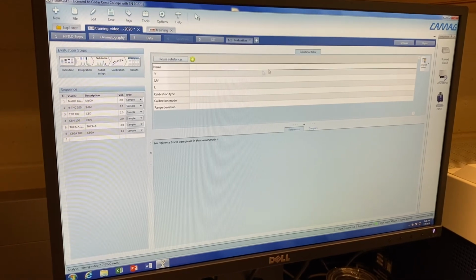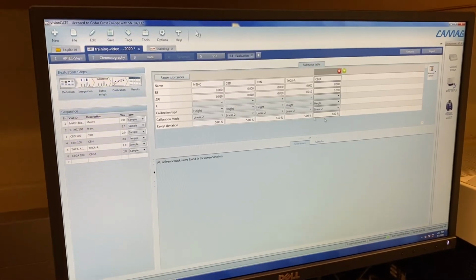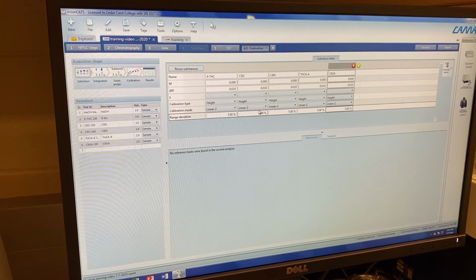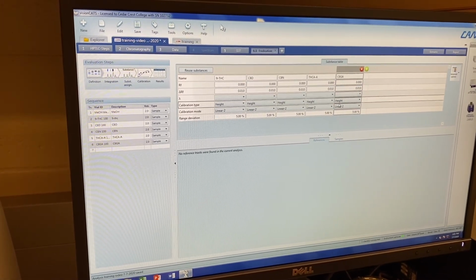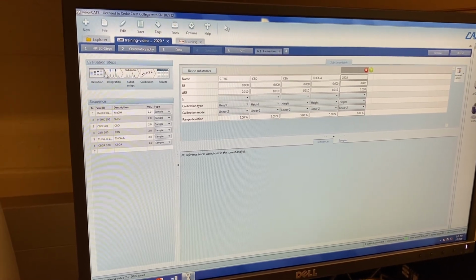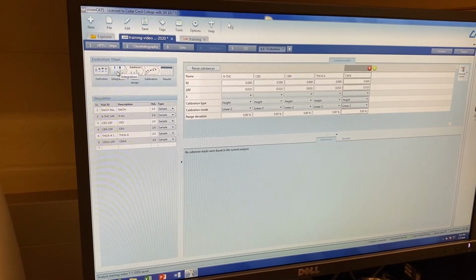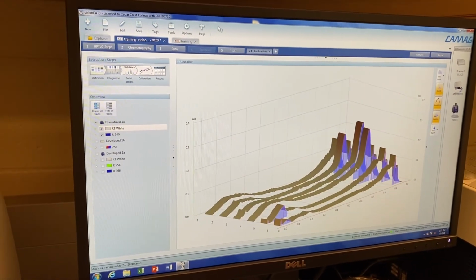Right here you can add what samples you have applied. And if you know there are Rf values from the literature, you can already put them in, but it doesn't really matter if you didn't. After this portion is done, we can move into the second part, integration, right here on the left. Just click on that, and then you can see this.